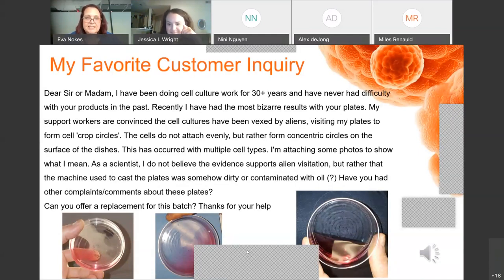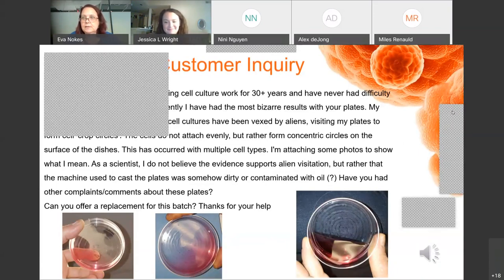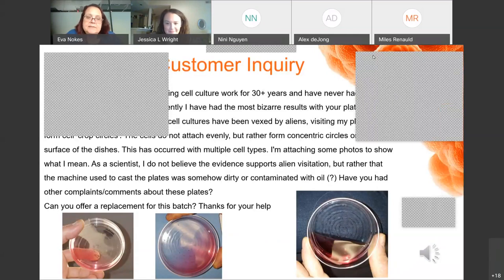So this is actually something that we've seen here and there. It's not an uncommon problem. I don't know if anyone can guess what the problem might be. I wouldn't have been able to guess, but maybe the engineers out there could guess. Or maybe people have seen this before, I'm not sure. No guesses? So this is a weird phenomenon that happens when there's any kind of vibration in the lab.